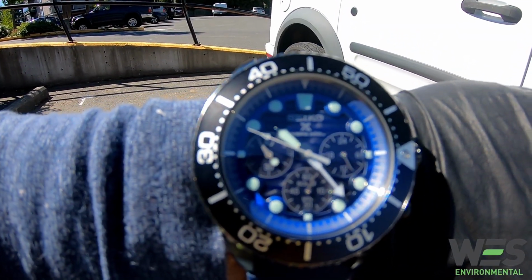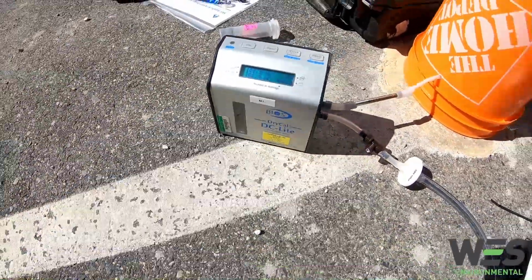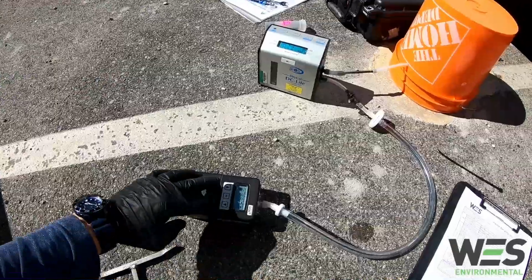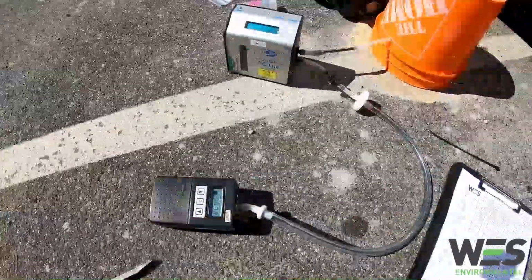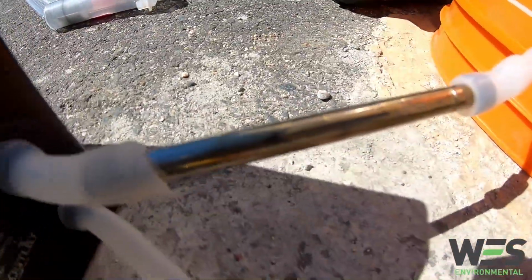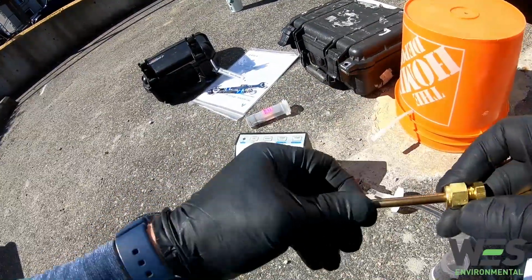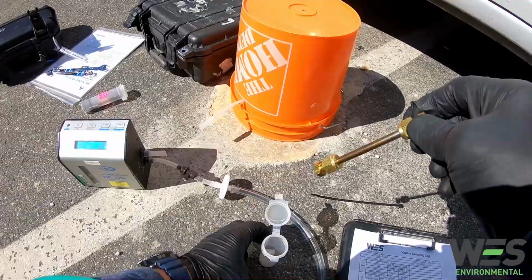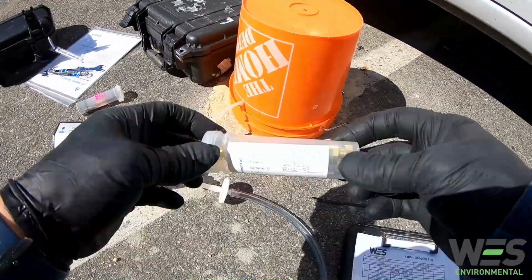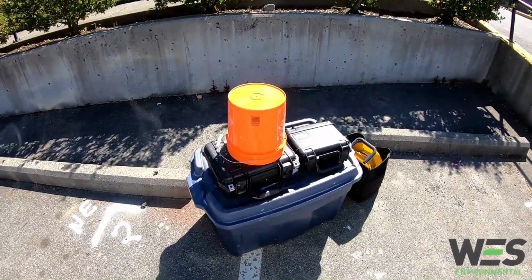Coming up on the 5 minutes here, 10 seconds to go. I'm collecting my final reading, 101.9. That's awesome. So 5, 4, 3, 2, 1. Kill the pump. There we go. That's 500 milliliters in the TD tube. Got the sample. I'm going to seal it up again. Putting the screw caps on, make sure they're nice and tight. Pop it in the air sealing tube. We're good to go. Got what we came for, all packed up, and I'm moving on to the next location.